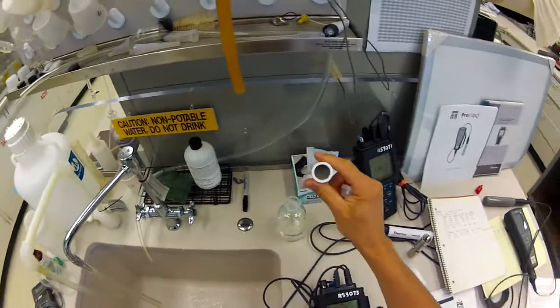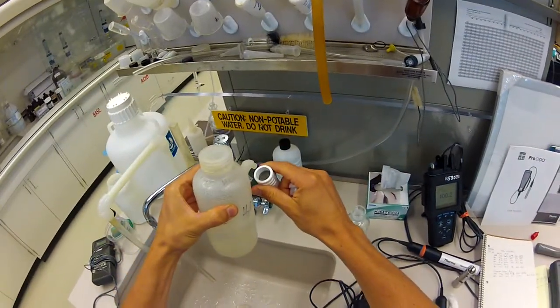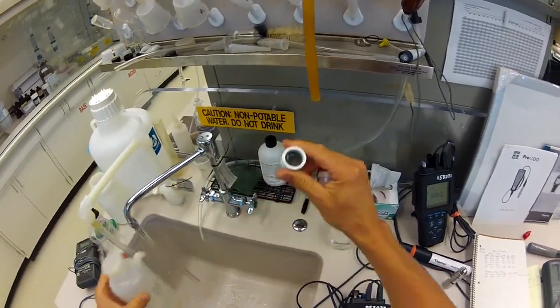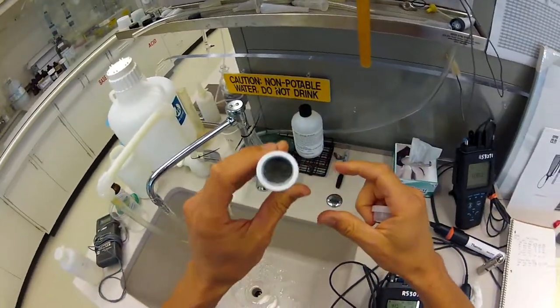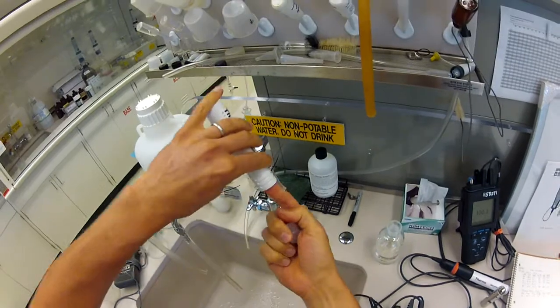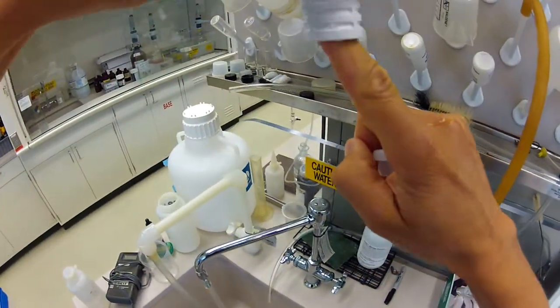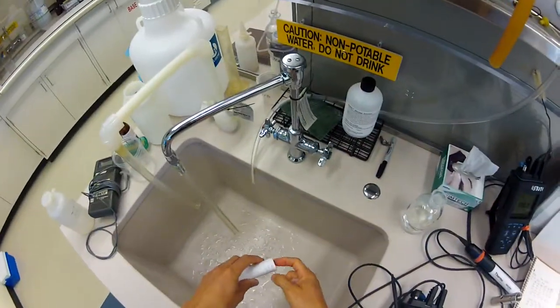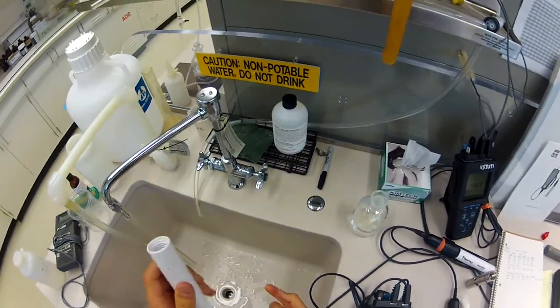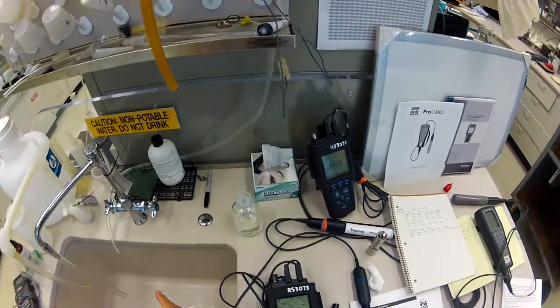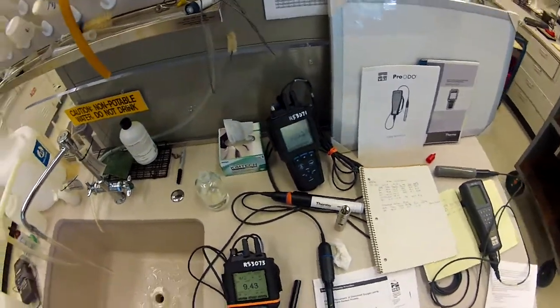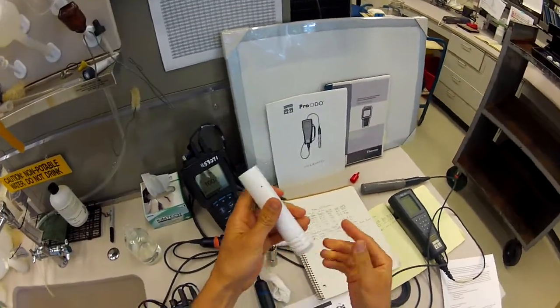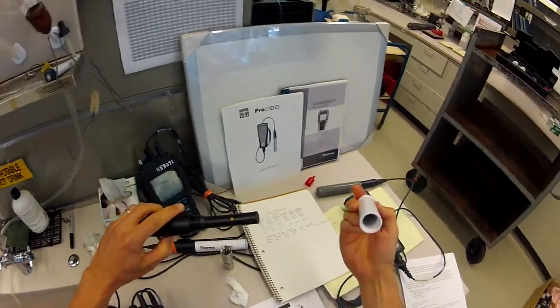Now I've got that dry and I want to make sure that I have moisture on this sponge, and that moisture is what's going to give me the water in the saturated air. I can feel that my finger is moist when I pull it out of there. If you needed to, you could put a couple of drops of water in, but you don't want it to be soaking, saturated like that in the sponge so that when you press on it you get drops of water falling out. That's not going to maximize the water to air surface area. It's better to have it just kind of moist. That's going to give you the most rapid equilibration.